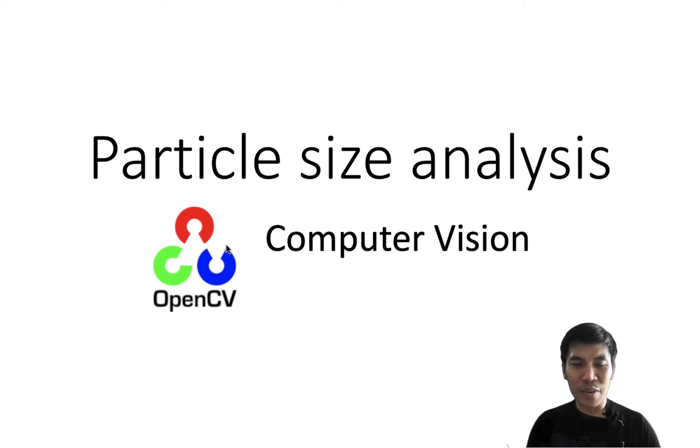I have another tool to get the grain size distribution by using computer vision. You can get the particle size distribution of sand at your home. I developed this code myself using OpenCV, written in Python language.